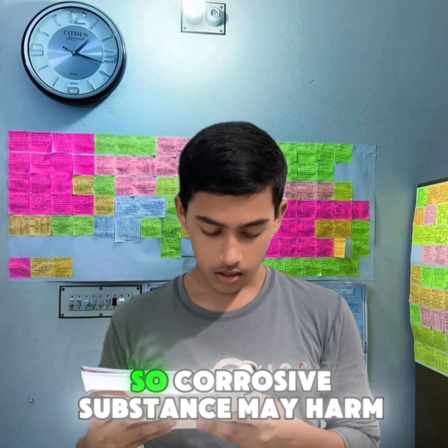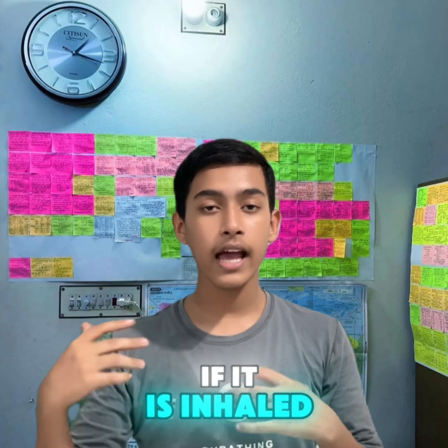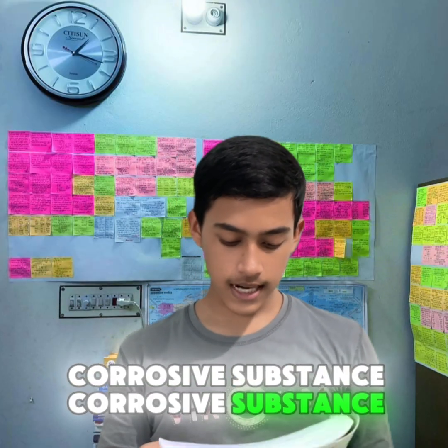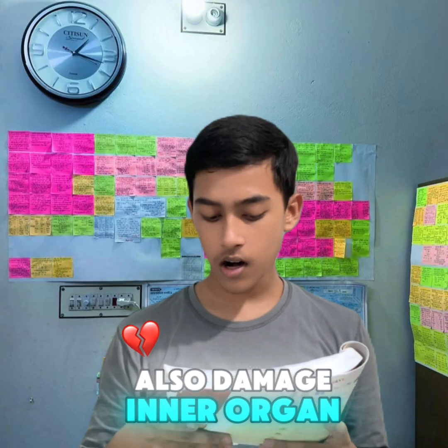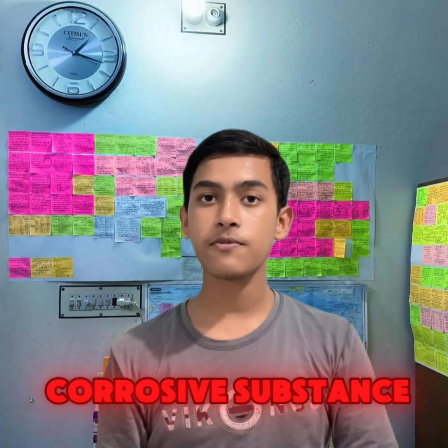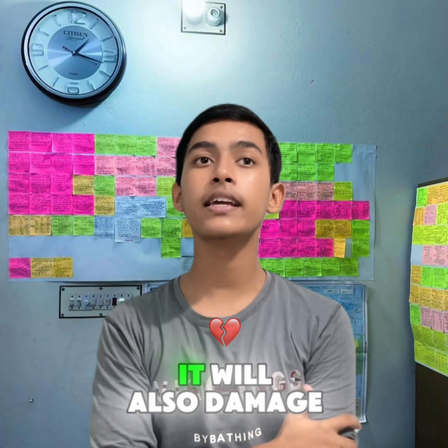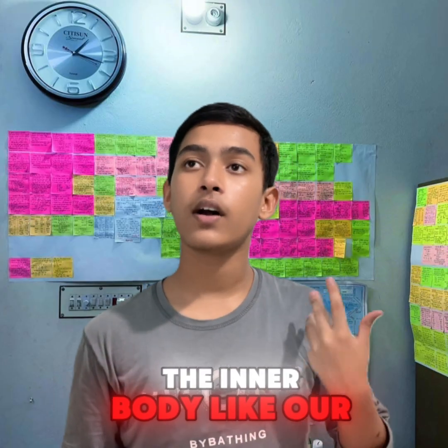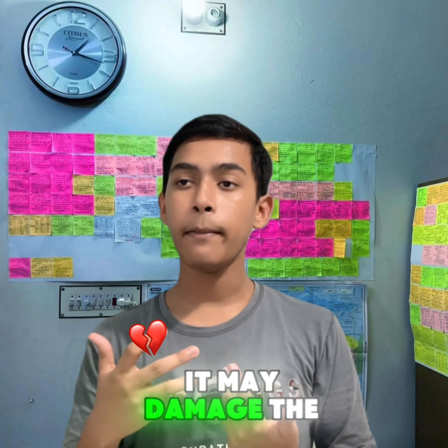So basically it means that if we touch a corrosive substance, it may harm our outer body, or if we inhale the gas of a corrosive substance, it will also damage the inner body, like our lungs, liver, heart, and brain.